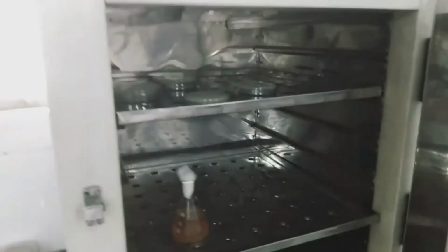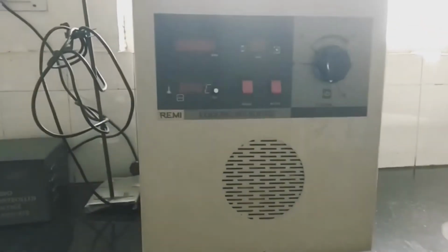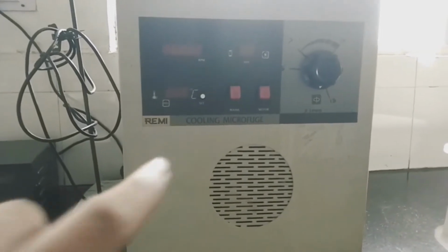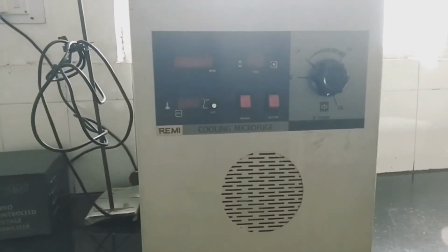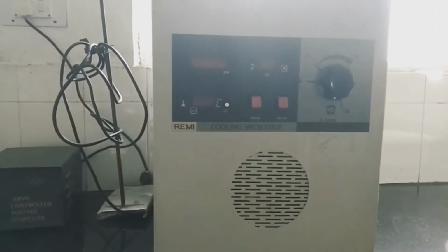It's just a place where we have to grow the bacteria at an optimum temperature. That's the only principle of an incubator. Okay, third instrument, that is the cooling microfuge. As you can see in the label also, cooling microfuge is written there. It is an instrument which is commonly known as a centrifuge.